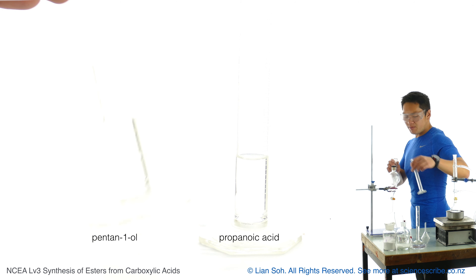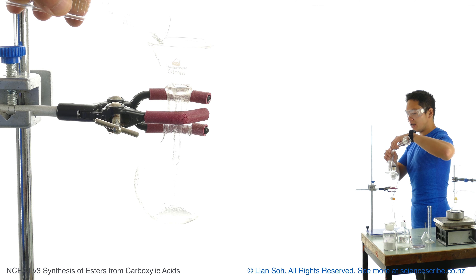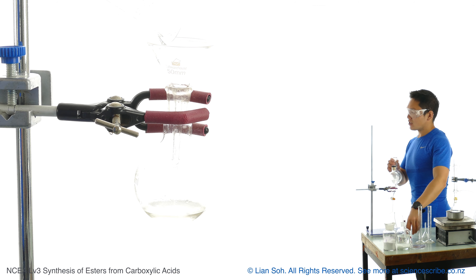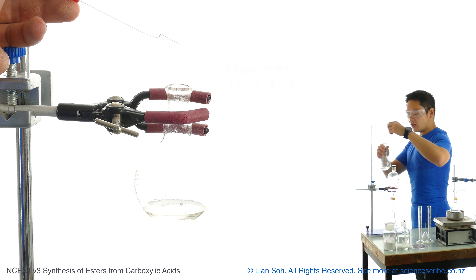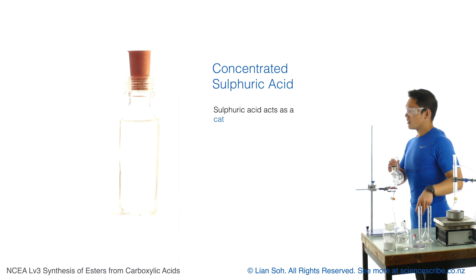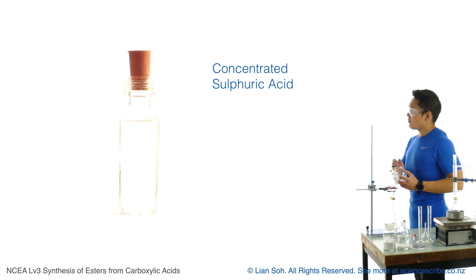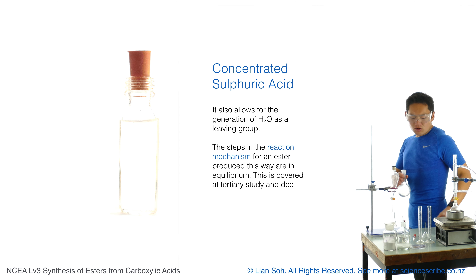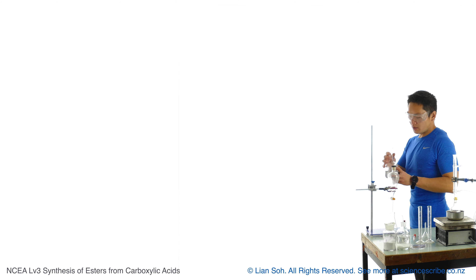Pentan-1-ol and propanoic acid are both colourless liquids, and when I add these two to the flask, it doesn't look like anything's happening. I'm also going to add just a small amount of concentrated sulfuric acid. The whole point is to drive the reaction forward so that I produce more ester product and increase my yield. It does that because water is produced on the product side, and the concentrated sulfuric acid helps remove the water, pushing the equilibrium forward.